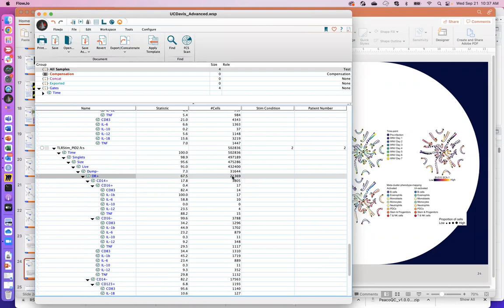If you don't normalize the numbers of events, it makes direct comparison between those samples difficult. If you have 7x fewer cells here and you just concatenate everything together without downsampling, you're going to have 7 times the number of cells represented for patient number 1. So when it comes to frequency differences between populations, you will always have to remember that in the original unconcatenated file there's a 7x difference between these samples, and it's not due to the treatment, it's just due to the fact that I had fewer cells.